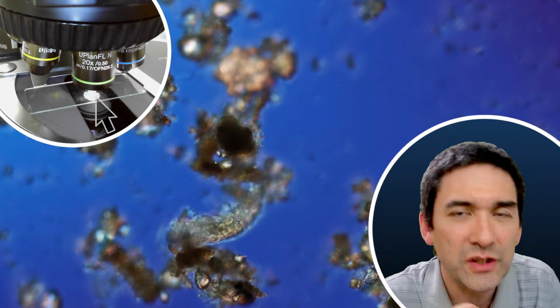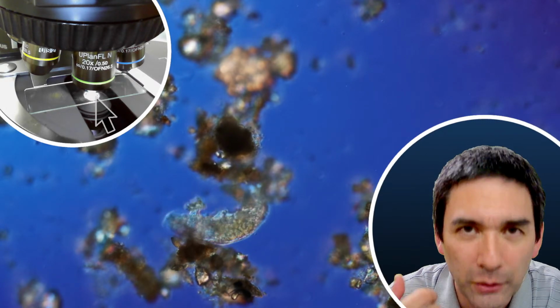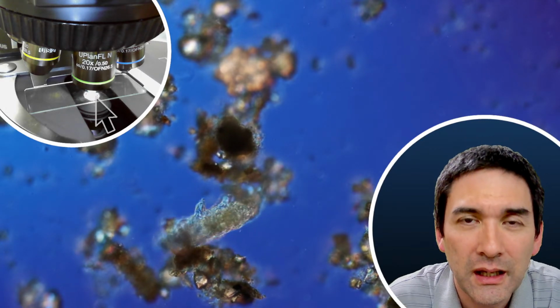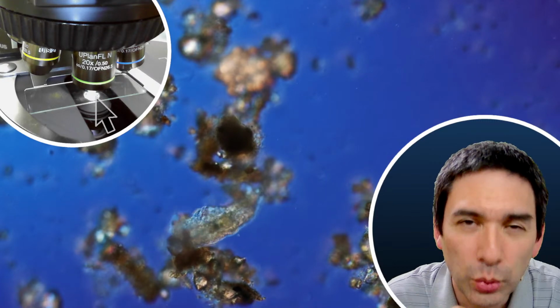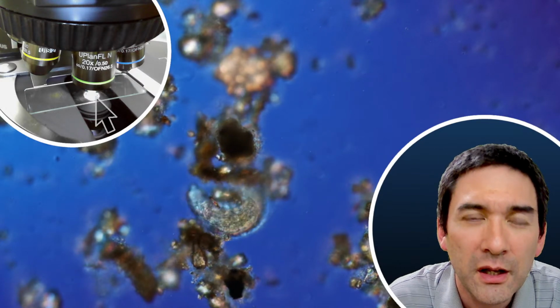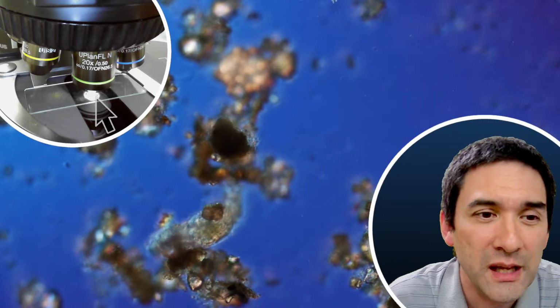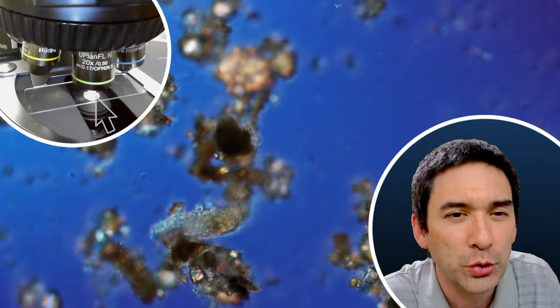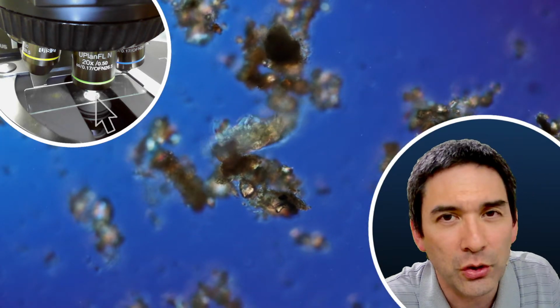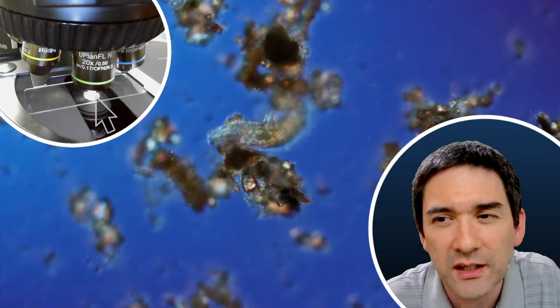But if possible, don't use those commercial spray cans for blowing dust away, because they contain some kind of propellant. When it expands, it cools down very quickly, and you don't know if there are some kind of deposits forming. Those spray cans are good for removing dust and dirt from computer parts, for example, but you probably should not be using them on optical surfaces. But it's okay to use them on other parts of the microscope to remove the dust. I would probably not risk it on the optical surfaces.